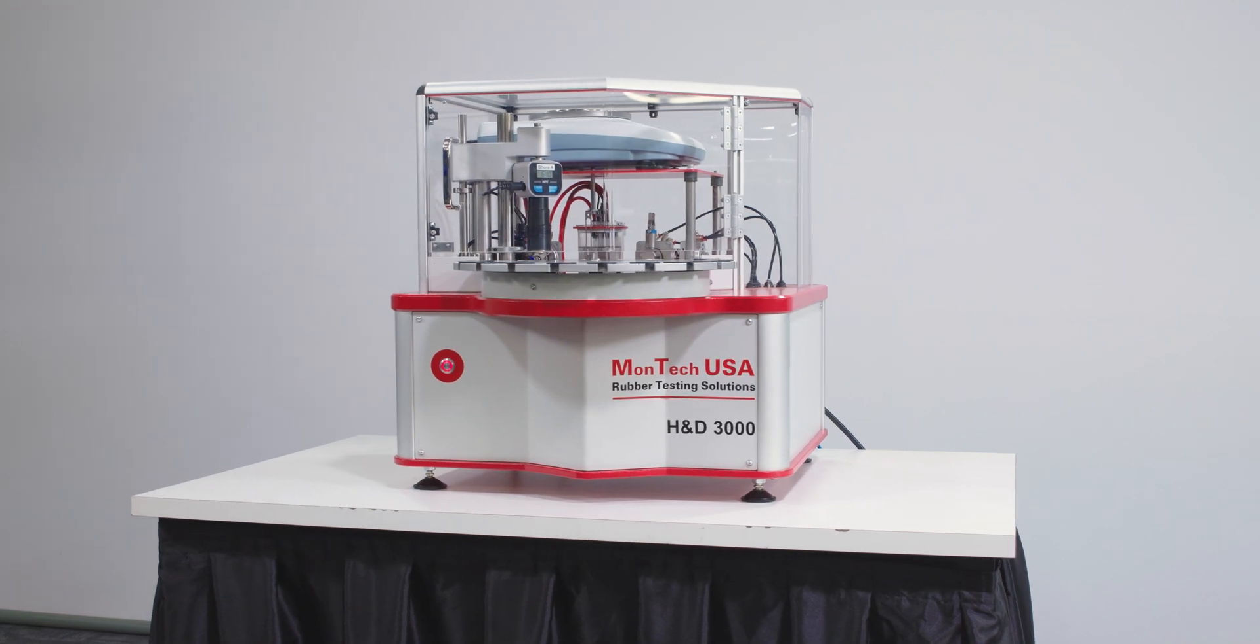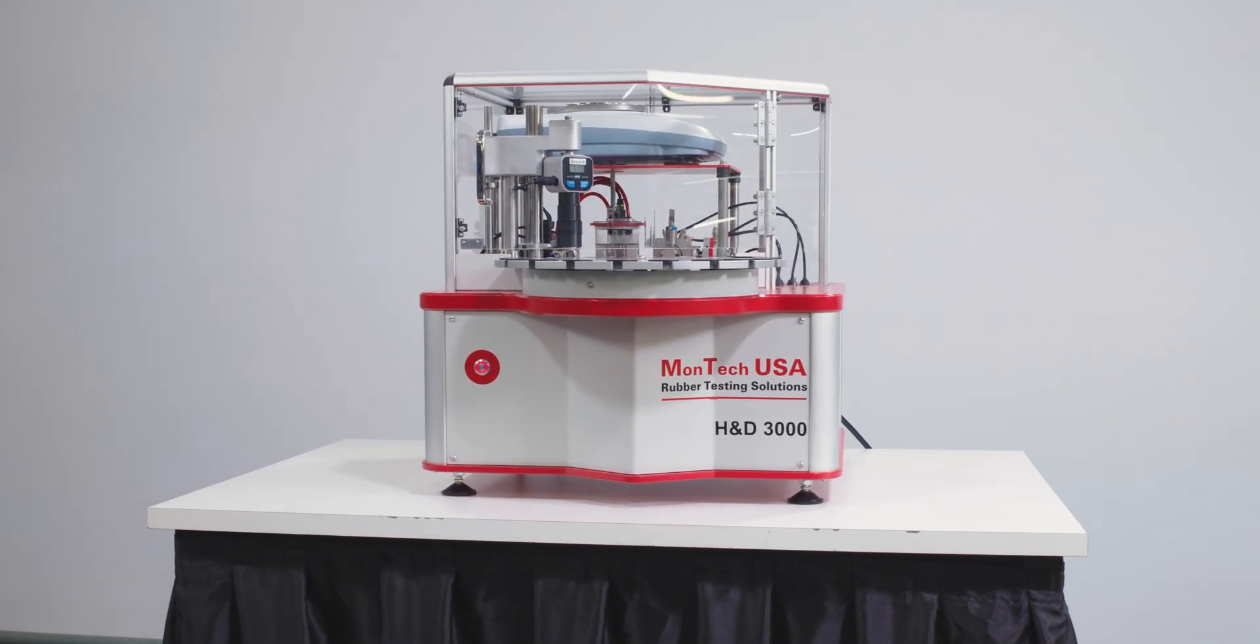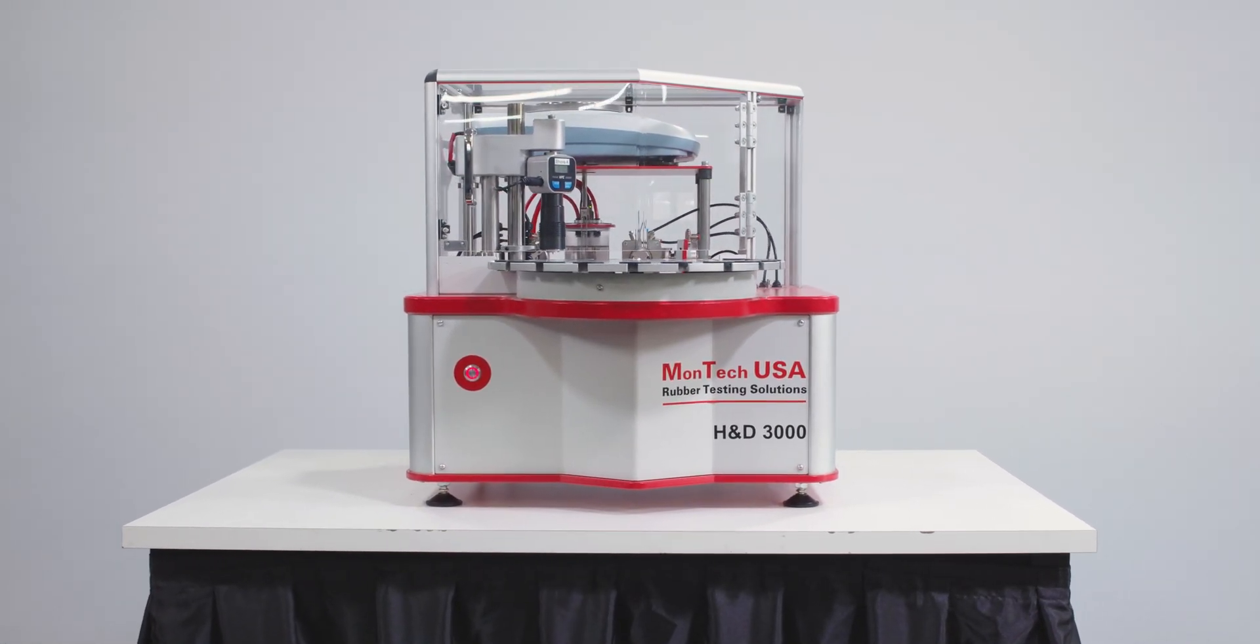Montec's H&D 3000 is two instruments in one, testing both the hardness and the density of cured rubber samples.